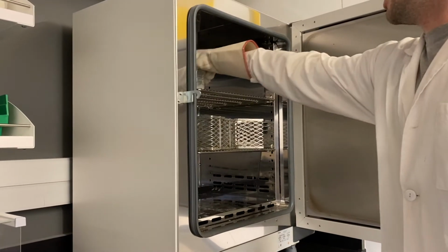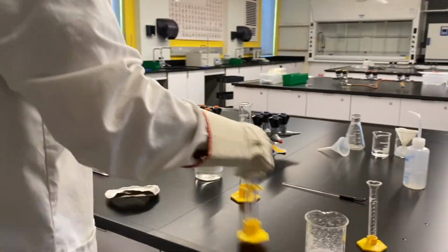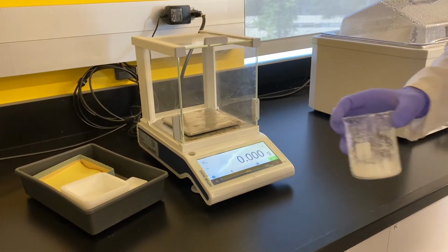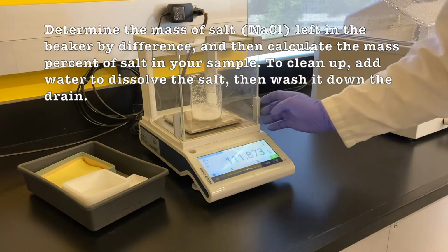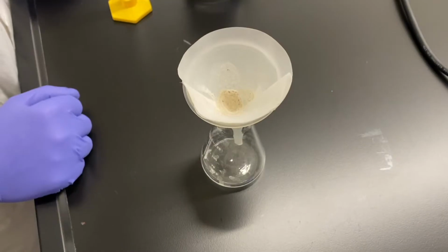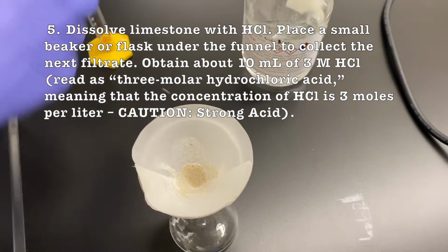Okay, here we go. We're going to take the weight one more time. We let it cool down a little bit first just so we don't damage the balance at all. They're pretty expensive. All right, and you can see it's a little bit lighter, so we did boil off a little bit more water, or dry off.